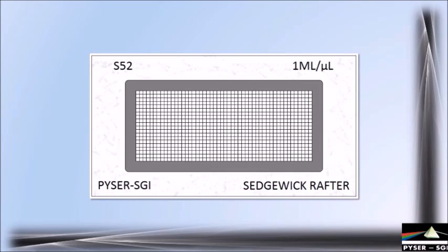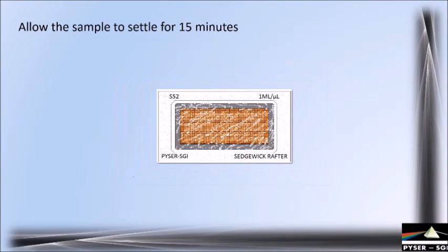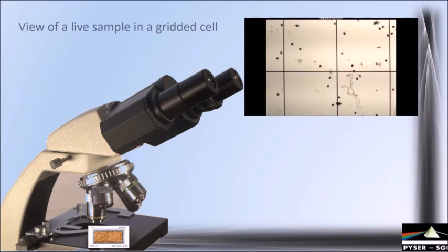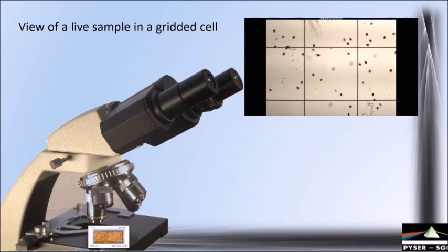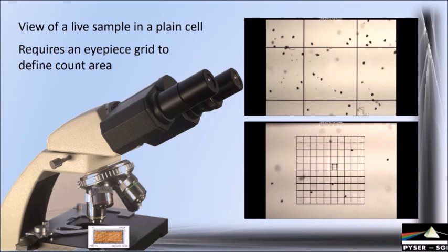Let's take a more detailed look at the Centric Rafter chamber and how it's actually used in practice. To recap: place the cover at an angle, fill from one edge with a hole for the bubbles to escape, so you fill the chamber fully to its one millilitre limit. Then allow the chamber to settle for about 15 minutes before placing it onto the observation microscope. It's important to let it settle and also ensure an even distribution of the sample. For a plain-base Centric Rafter with no gridded bottom, you have no idea of what area you're looking at other than the field of view, so you use a Whipple grid or some other grid in the eyepiece to identify a known counting area or volume for the sample.